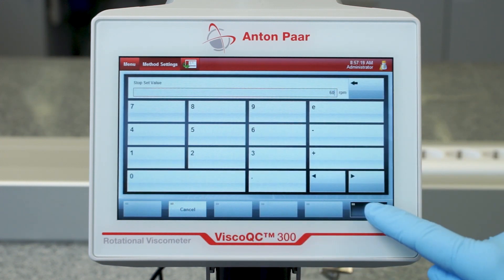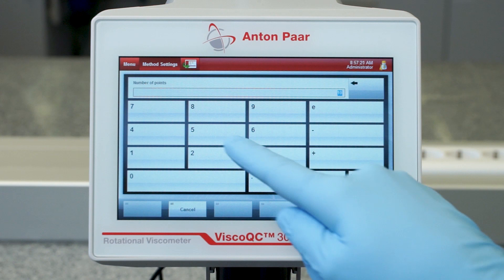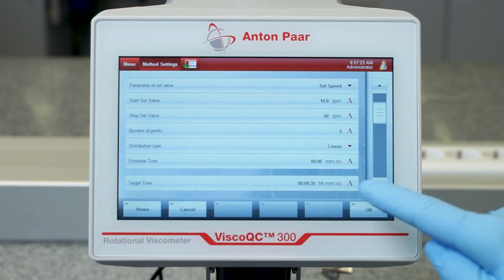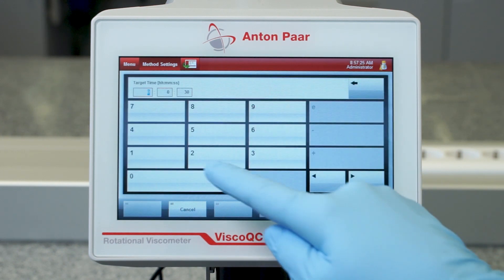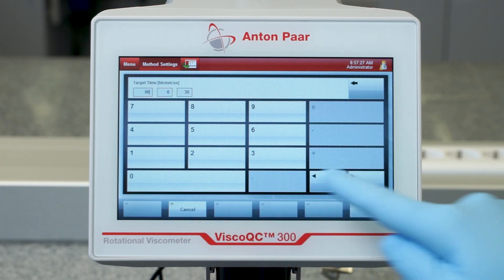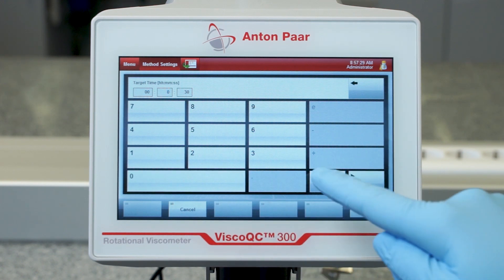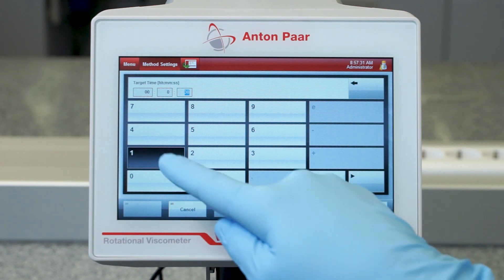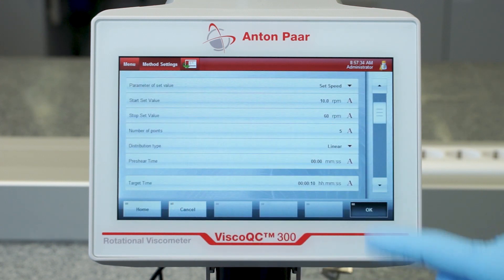Simply change your start and stop speed, number of points, and any setting that you would like to adjust. Tap OK when you are finished to save the method.